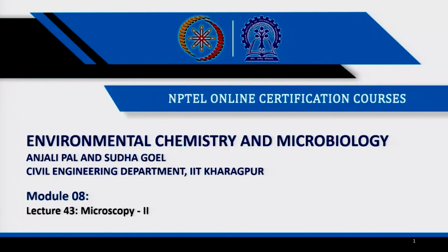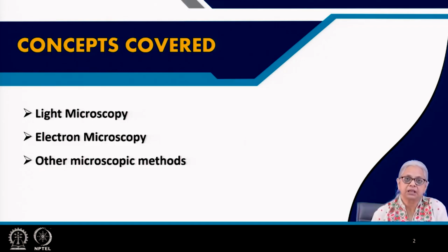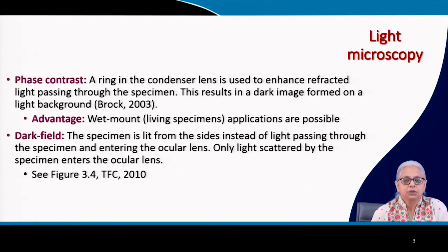Alright, welcome everyone. This is the last lecture in module 8 and the last part of microscopy. This is lecture 43. So as I mentioned in the previous lecture, we are going to be covering the remaining part of light microscopy as well as electron microscopy and a few other recent developments in microscopic methods. So let's continue with light microscopy.